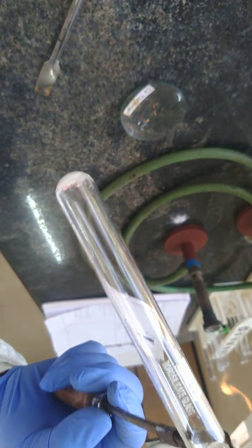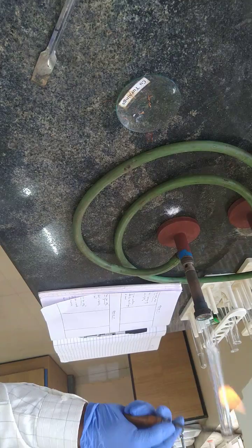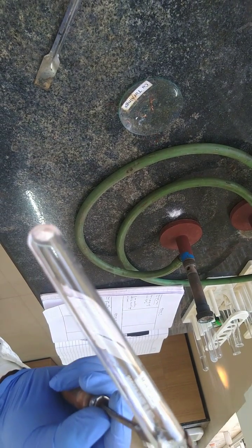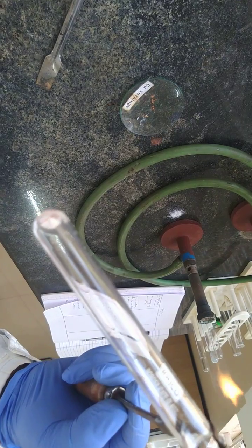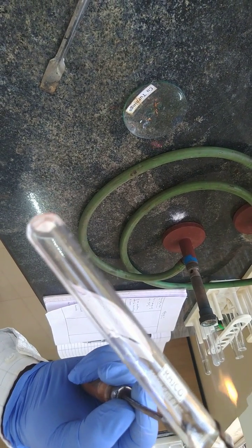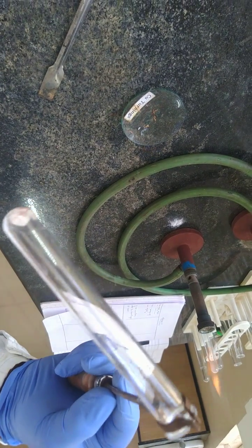Yes, so you can see the copper turnings in the test tube. After adding copper turnings, you are going to heat it on the Bunsen flame. Yes, even after the heating we are not getting any action, we are not getting any reddish brown gas, which means it is having no action. Therefore group 2 is absent.